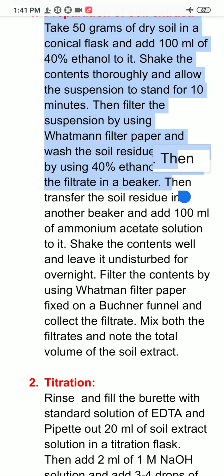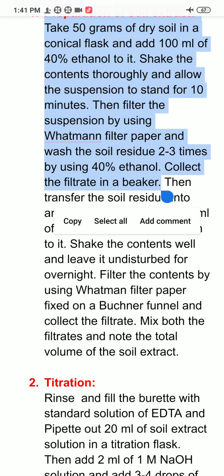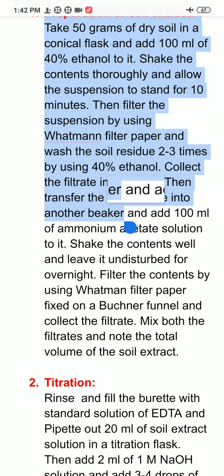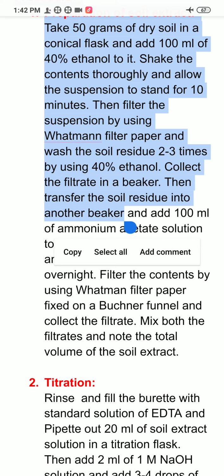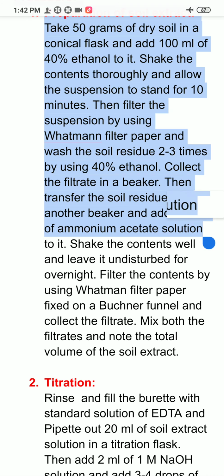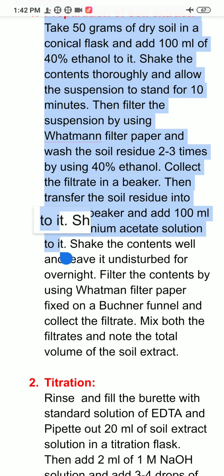Then collect the filtrate in a beaker. Then transfer the soil residue into another beaker. Residue here means what is left on the Whatman filter paper, and to that we will add 100 ml of 1 molar ammonium acetate solution.